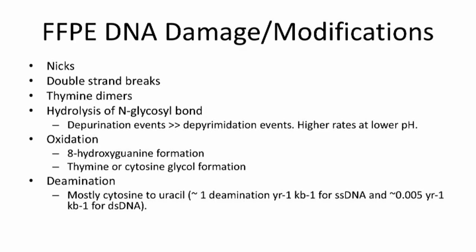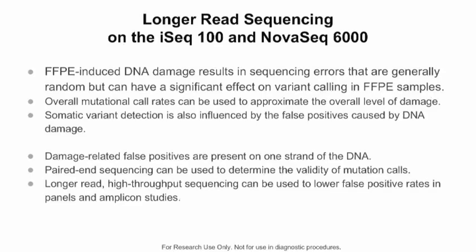And then, again, I know this was probably covered well, but these are all the normal DNA damage modifications that are seen in these types of samples. And so one mechanism we're looking at now on these projects, and I don't have a lot of significant data on, is running, since these are short insert libraries already, those on longer read sequencing conditions to get essentially both strands, so intentionally overlapping the strands with the paired end reads, so that a number of the C to T transitions, et cetera, that happen, you can actually correct for them because they're only detected on one strand, not both.